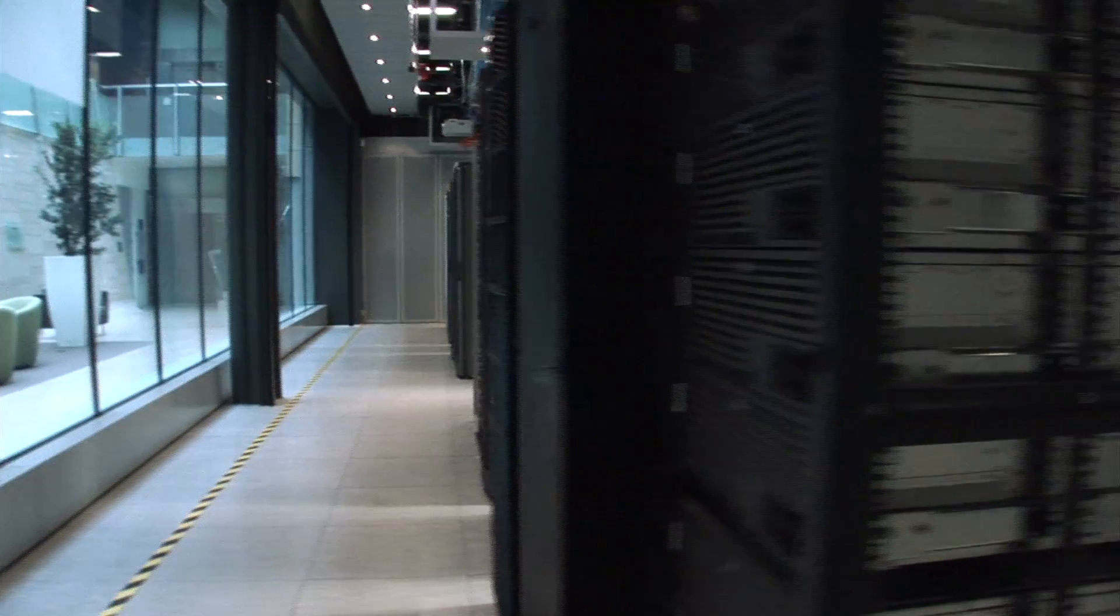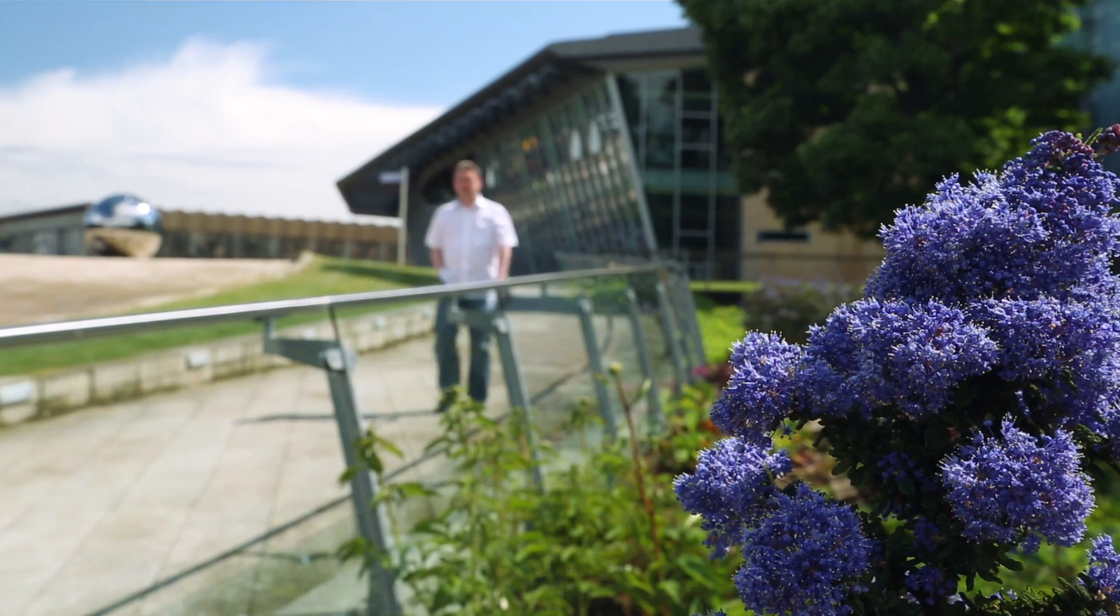These machines are running at the absolute limit of what they can do. Support is critical in this space.